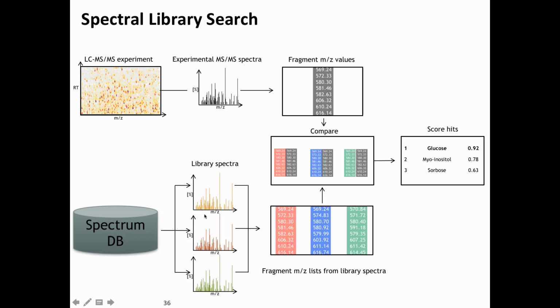And now you need to be careful because one of the big issues is you need to have a similar fragmentation, a similar instrument that it was recorded on. And depending on how you do that, you might get no hit or might get wrong hits. So that's something to keep in mind, and you need to be careful with your metadata and how you select that.